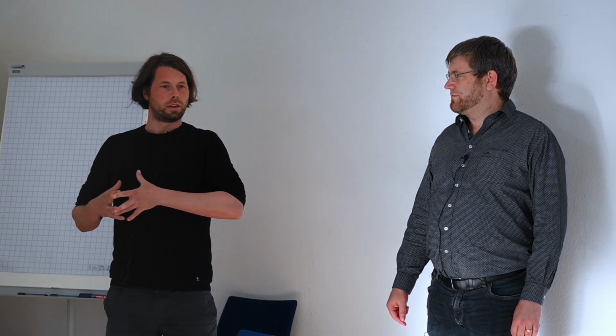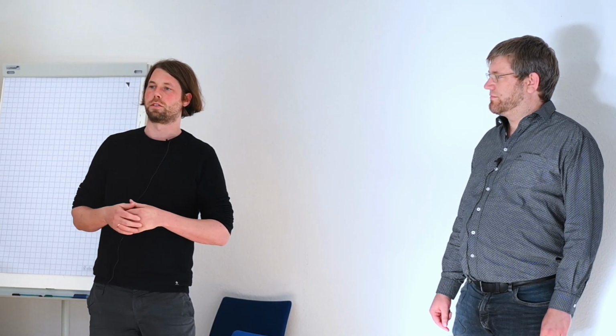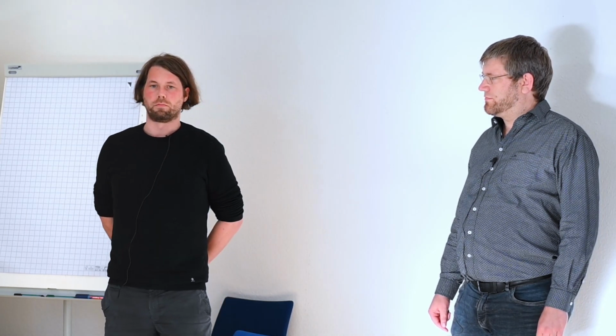Okay, so the idea was to translate our complex processes in the QC lab into technical models to orchestrate the workflows required for our lab technicians. So the idea was to translate it into different SiLA services so that we can execute them in a way that we wanted to be planned.